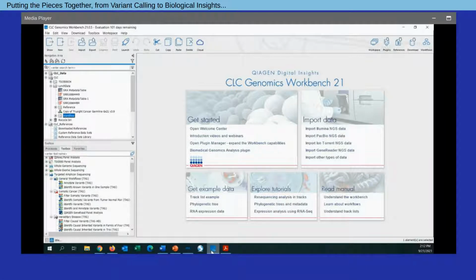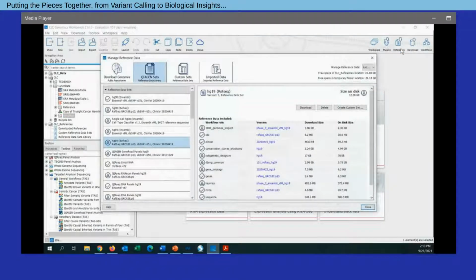So as I mentioned, with regards to any NGS-based analysis, the first step we're going to do is capture the reference information. And if you direct your attention to the top right corner of the screen, the CLC Genomics Workbench makes this step very easy. We simply need to click on References. And what we've done here is QIAGEN has actually curated sets of reference information that will be useful for the various workflows that we offer in the software.